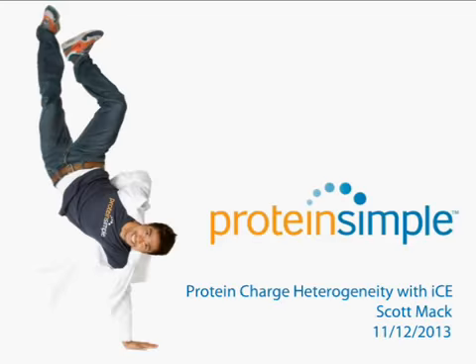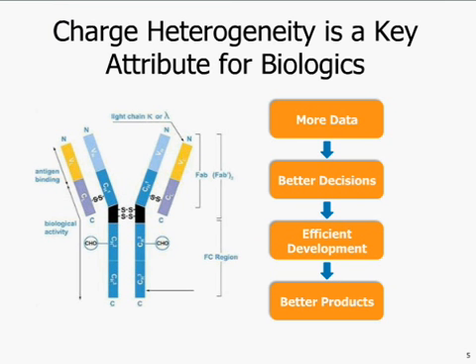Charge heterogeneity is a key attribute used to assess the stability and capability of a biological manufacturing process. Many of the critical posttranslational or chemical modifications that can occur in a protein structure will affect the ionization of that molecule and will be captured by a charge heterogeneity analysis. As compounds become more sophisticated and characterization of the production process becomes more demanding, as in QbD efforts, analytical chemists face unique challenges. They need to generate better data faster in order to help speed up and improve product development.